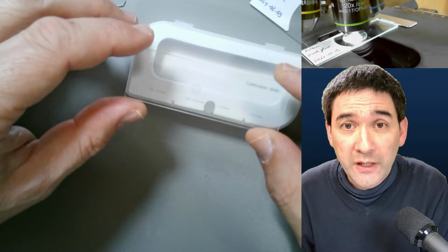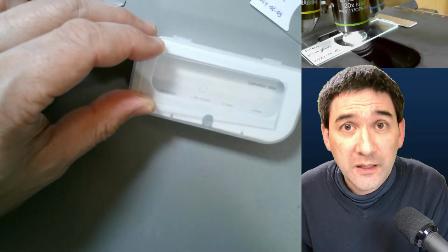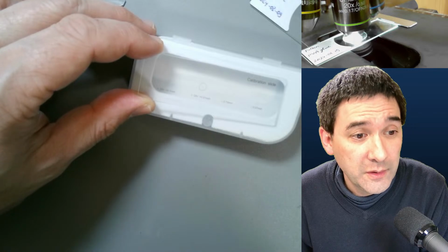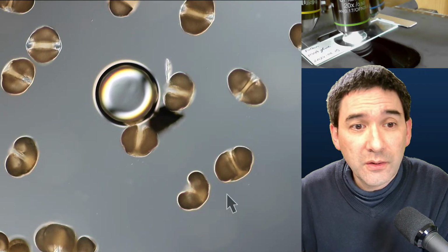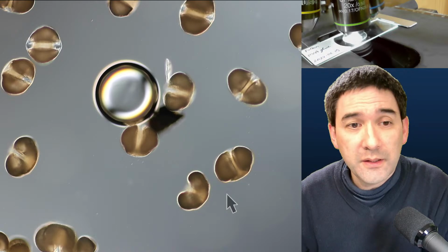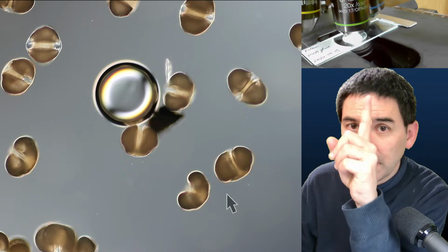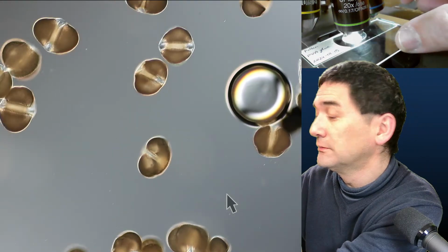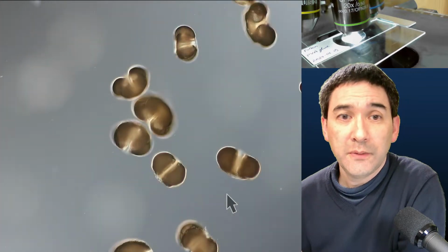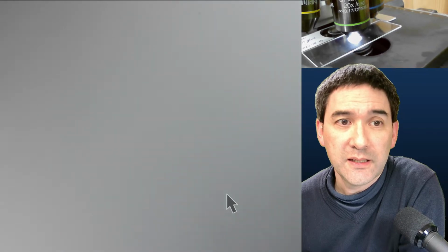So I'm going to show you now how this looks, and then at the same magnification we're able to see the size of a pollen grain. So what I'm going to do now is just watch what I'm doing here at the top again. I'm just going to add this slide here. Okay. And let's move the whole thing. And now the difficult part is I have to find it.